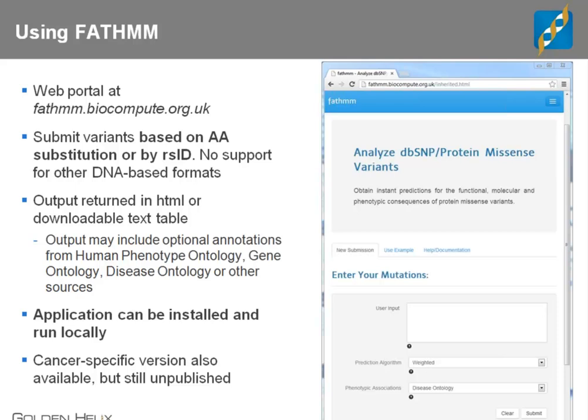It's not yet published. I think that it uses the same weighting method, but specifically weighted to identify known cancer-related variants. I'm not positive about that, but that seems to be what's going on. The paper describing the cancer version is in press, it says.